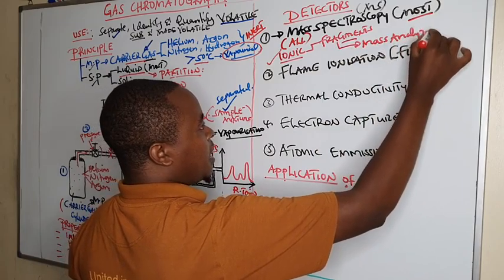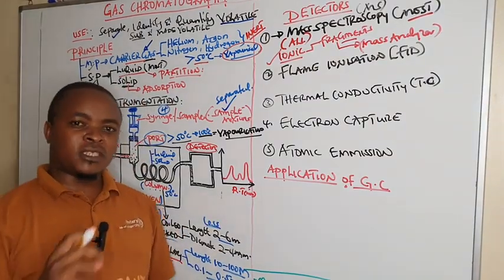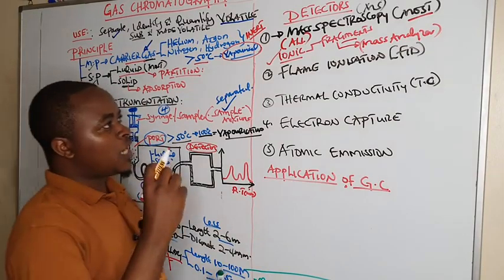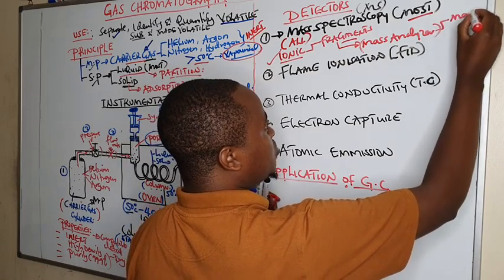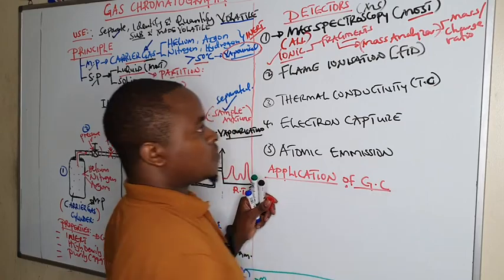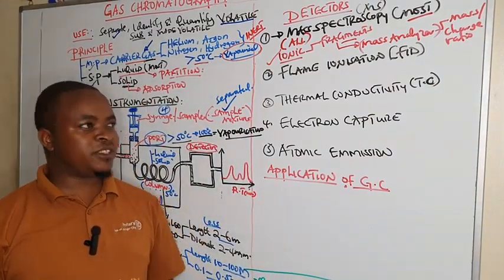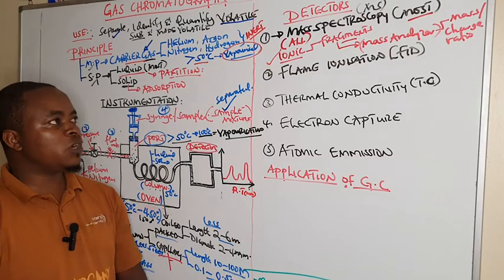This mass analyzer has different sizes, so it is able to measure these compounds according to mass to charge ratio.